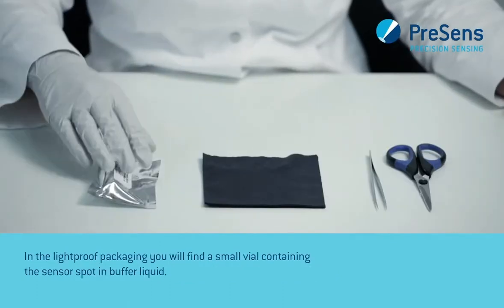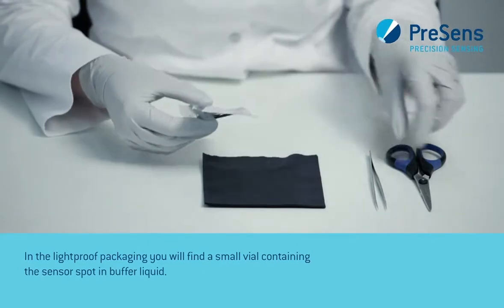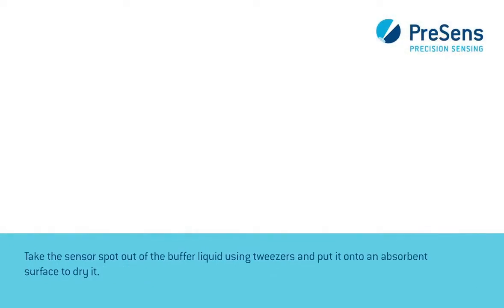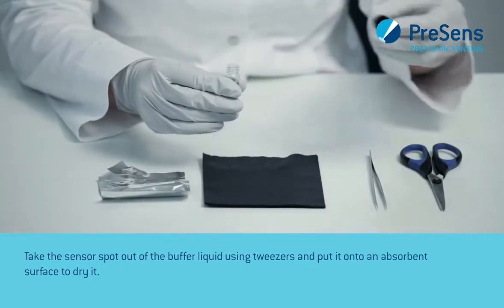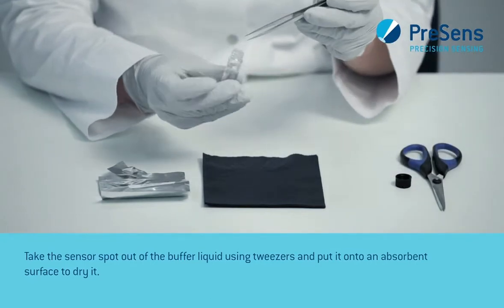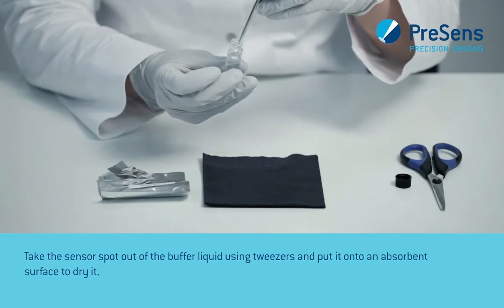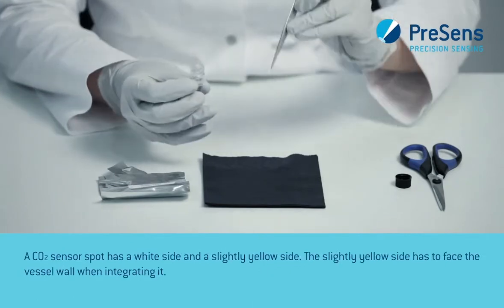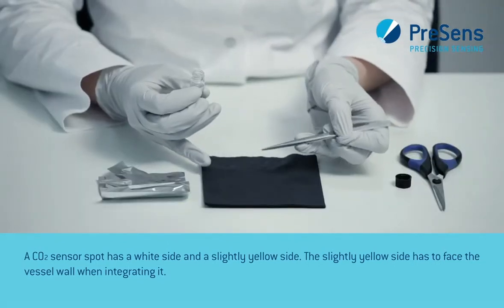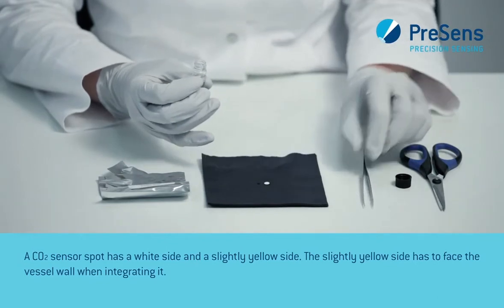In the light-proof packaging you will find a small vial containing the sensor spot and buffer liquid. Take the sensor spot out of the buffer liquid using tweezers and put it onto an absorbent surface to dry it. A CO2 sensor spot has a white side and a slightly yellow side. The slightly yellow side has to face the vessel wall when integrating it.